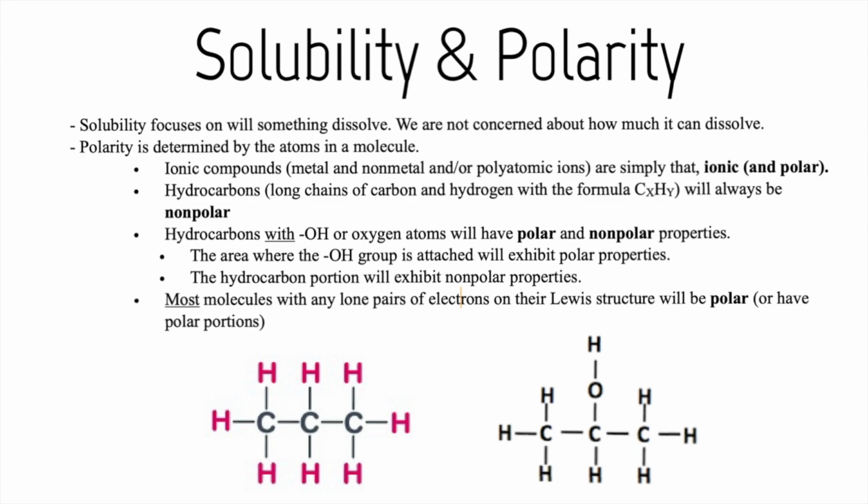That's solubility. That's our focus here. So we're not concerned with how much it can dissolve. As we get later in the video, I'll show you some technique things and what that looks like. Again, just do the two things really. Do they mix well together? Right. Not worried about how much they're mixing, just that they are mixing.